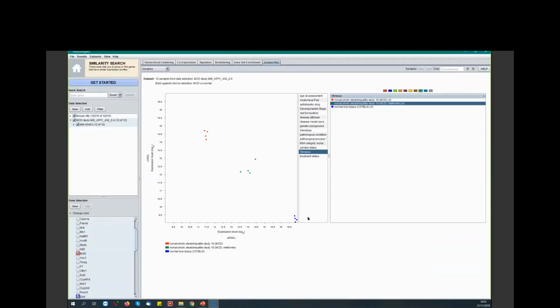And these results actually verify what the original paper had shown, that the metformin treatment seems to ameliorate the diet-induced inflammation and fibrosis. So this is one way in which we can choose biomarkers of the disease that can be verified, and this graph can easily be exported up here under results, export image. So as you can see, there's a lot more analysis that one can still do.